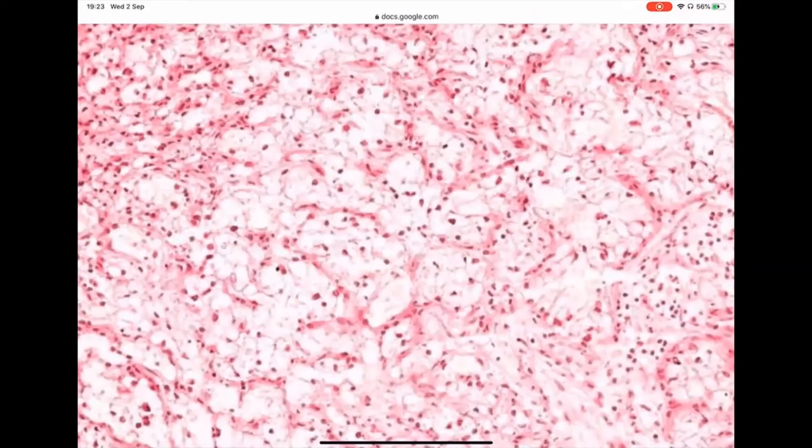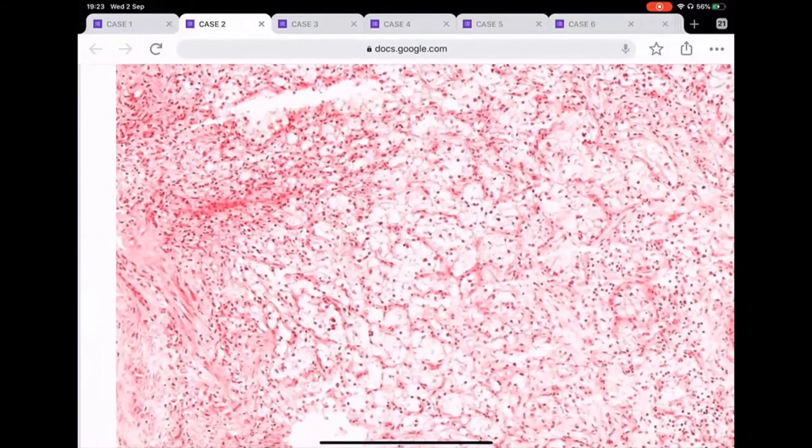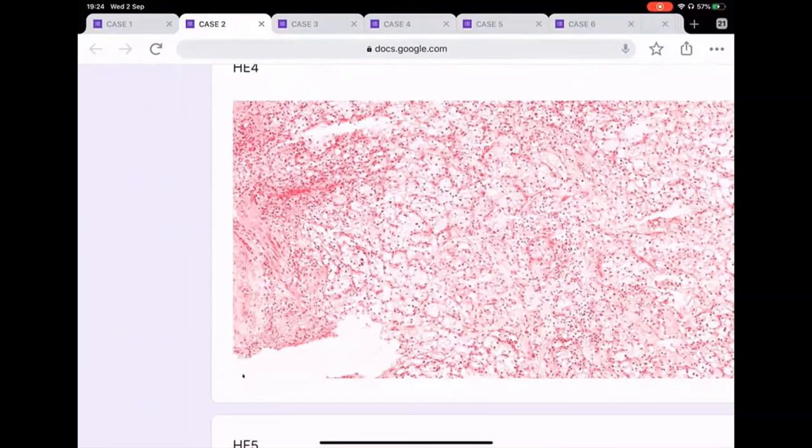The example of the adrenal rest that came in the exam was an adrenal rest seen in the testes, okay? So you have a testicular frozen section, and then it was an adrenal rest. The adrenal rest usually is a very small thing, and it usually will fit into a slide, by the way. Okay, so just remember this, because it is very important.